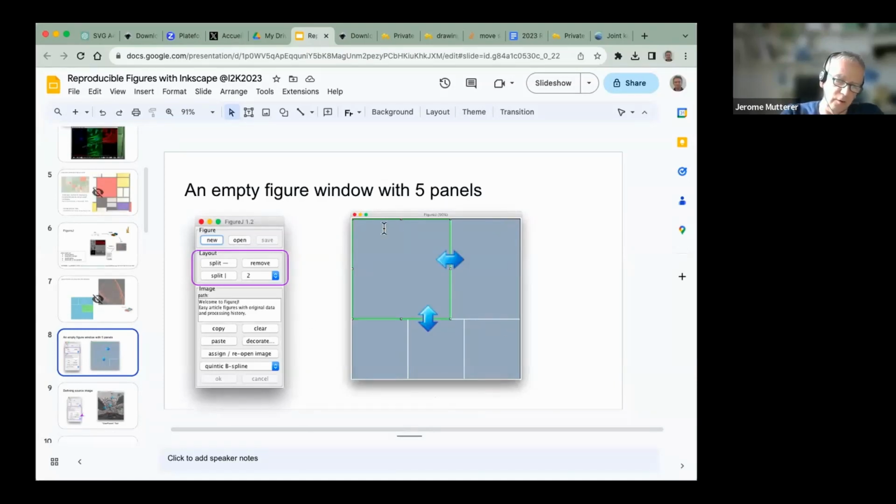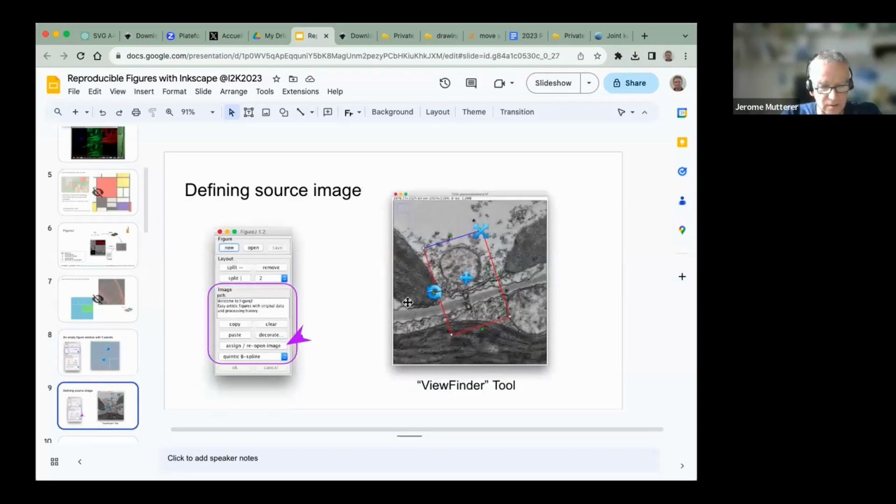You always had a whole space, and you needed to cut it into several parts, like a full space and then daughter parts, like a hierarchy of panels. But the computer can do this very easily and efficiently. So it's a good assistant to perform those tasks. Of course, the selection of the interesting area was crucial.